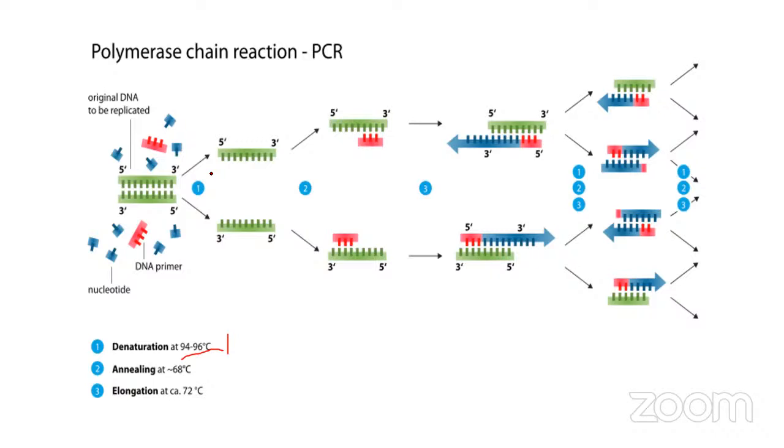Agreed? Okay. So the next one, I've mentioned probe today, right? For hybridization, right? For PCR, we're using a primer. For amplification, we're using a primer. So the next thing here is your primer. The primer can be a forward primer or a reverse primer. I will explain what that means with this diagram. So the next thing we have is the nucleotides. You know what nucleotides are? Those are the units that make up the DNA, agreed?